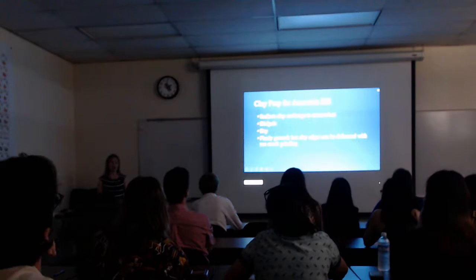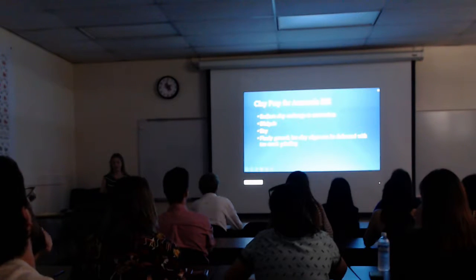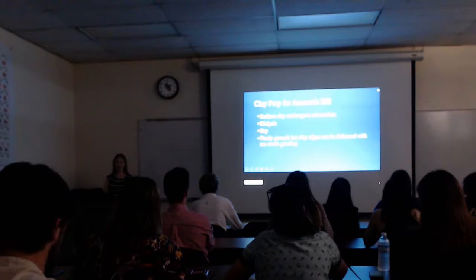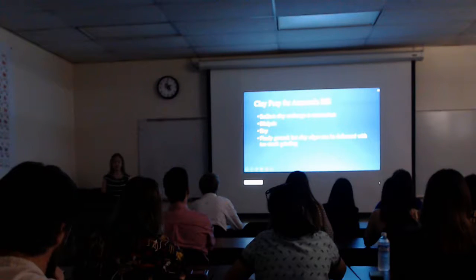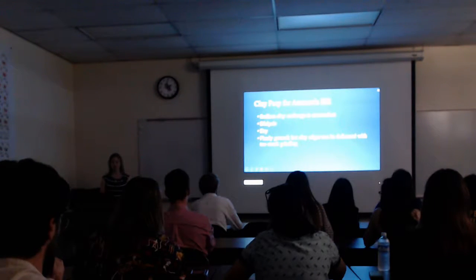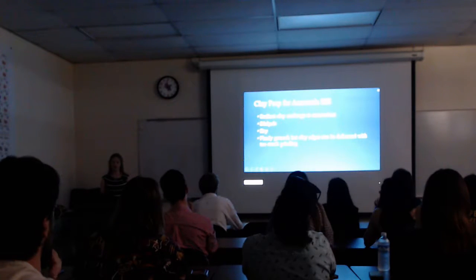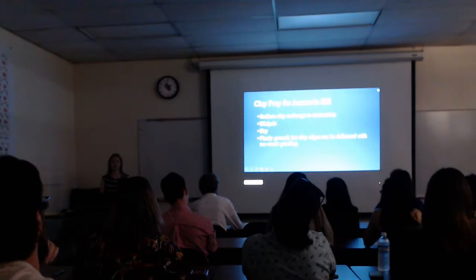You had to prepare the clay in order to undergo the ammonia gas selective electrode method. The sodium clay had to be exchanged into ammonium clay and put back through dialysis and dried so that it would be able to react to produce ammonia gas. We had to finally grind our clay, but you had to be very careful trying to grind it because the clay edges could be deformed if undergoing too much grinding, and this could result in jagged edges that would not react very well.